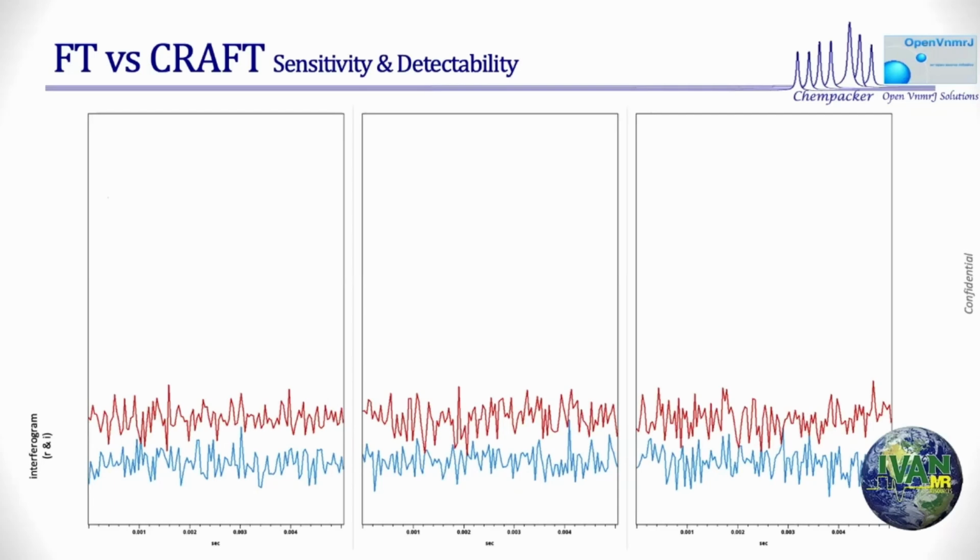So these are 3, just almost done. I'm only 3 more slides. But this is an interesting slide. 3 interferograms. Here's a challenge to all of you. 3 interferograms, real and imaginary. Real is blue, imaginary is red. Why? I don't know. At that time, I had the real imaginary turned on, so it gave me both, and I just took a snapshot of it.